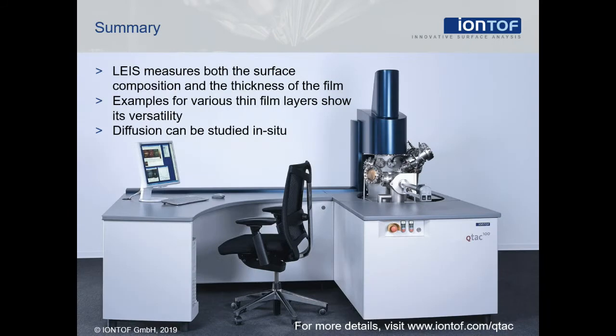To summarize, LEIS is very well suited to study thin films from submonolayers to several nanometers of thickness. It yields information about layer closure, growth modes, and thickness evolution, and can be applied to complex films. Diffusion can be studied in real time without any sputtering.